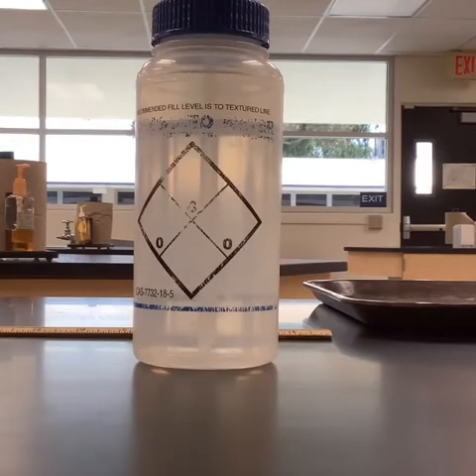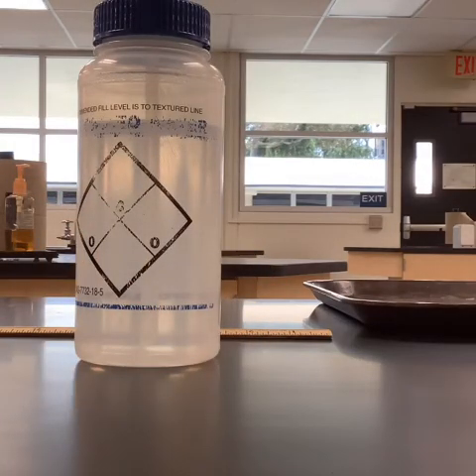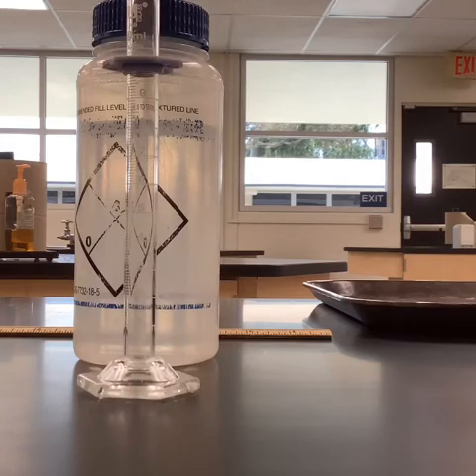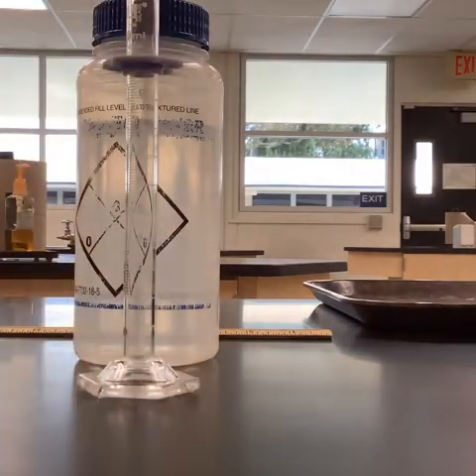The last thing that we're going to be finding the density for is water itself. So if we're trying to find the density of the water, we're going to need to get a mass and a volume. So the first thing that I'm going to get is the mass. Now, the deal is, I don't want to just go ahead and weigh the entire bottle. So I'm going to be pouring some of that water into a graduated cylinder. So if I pour the water into the graduated cylinder right now and fill it up, I'm going to have the mass of the glass included, and I don't want that.